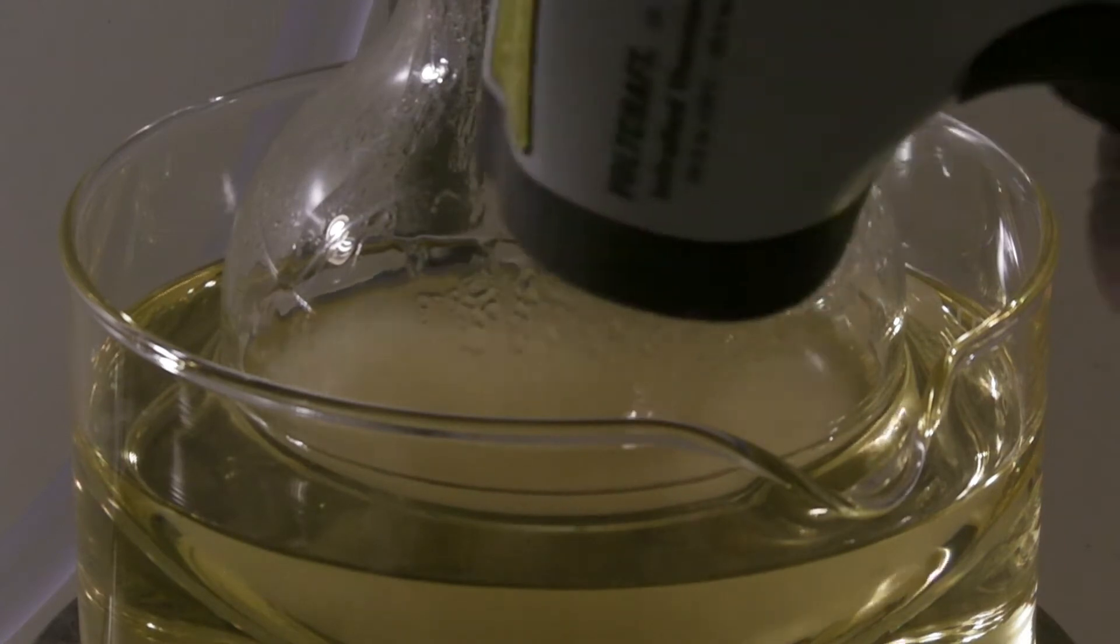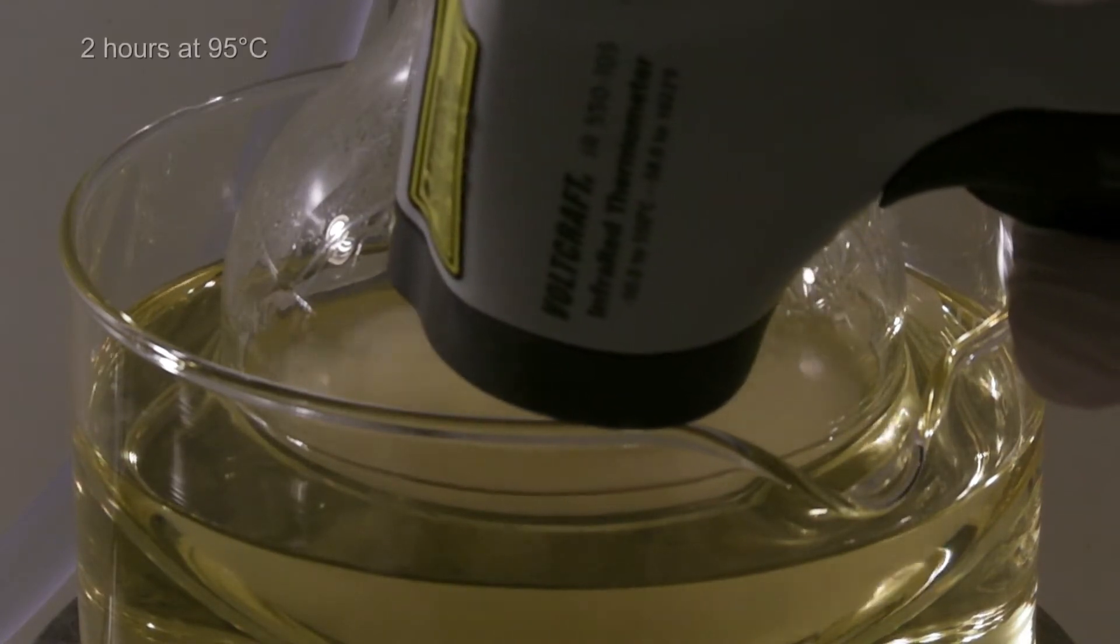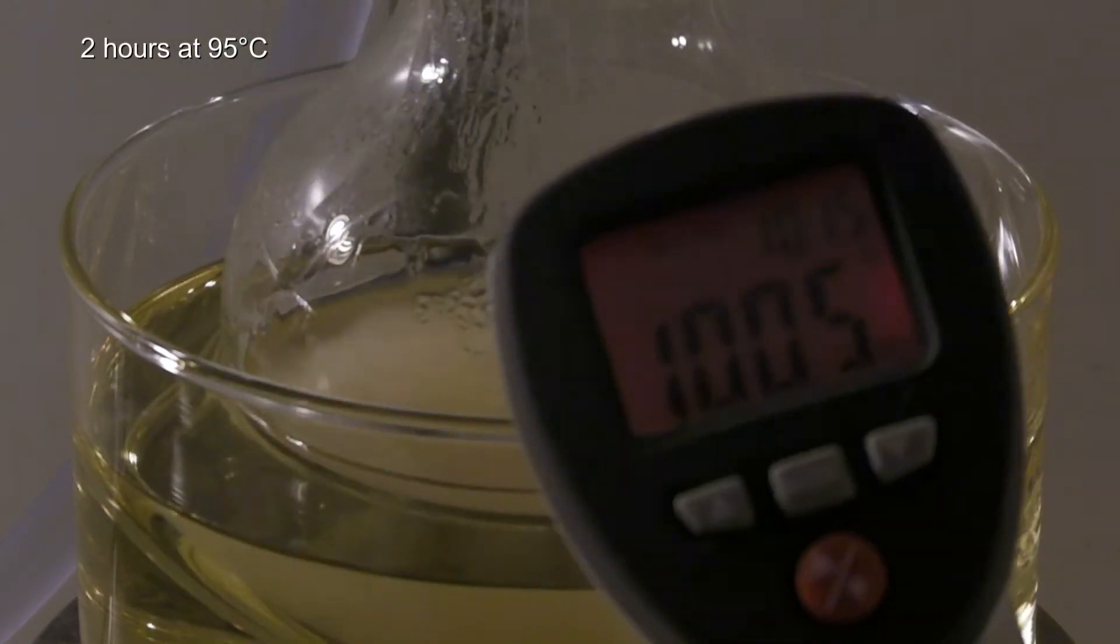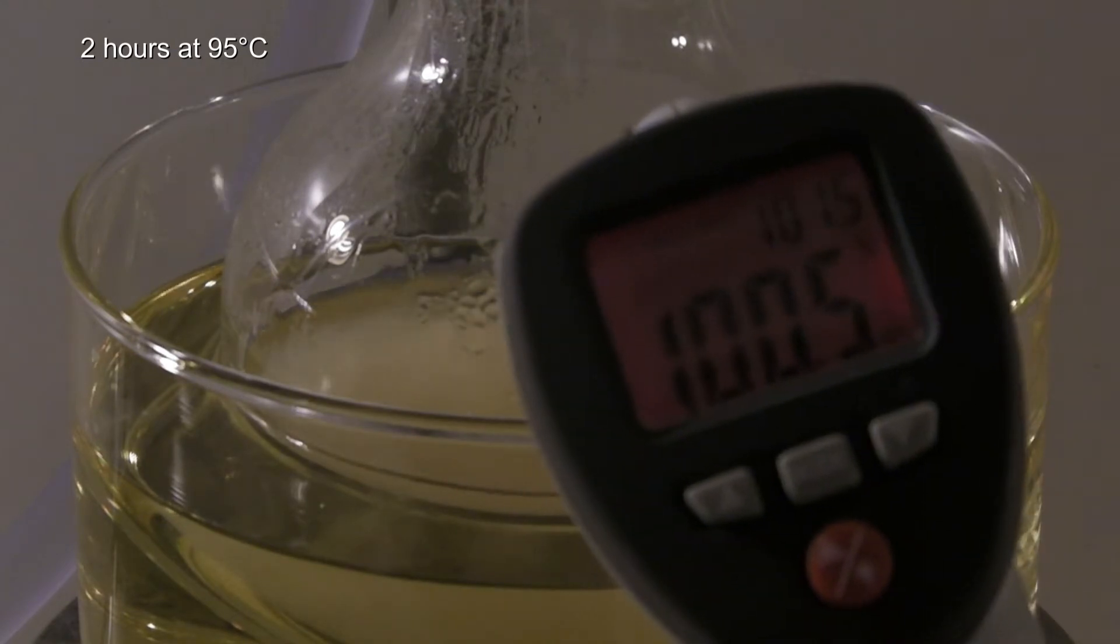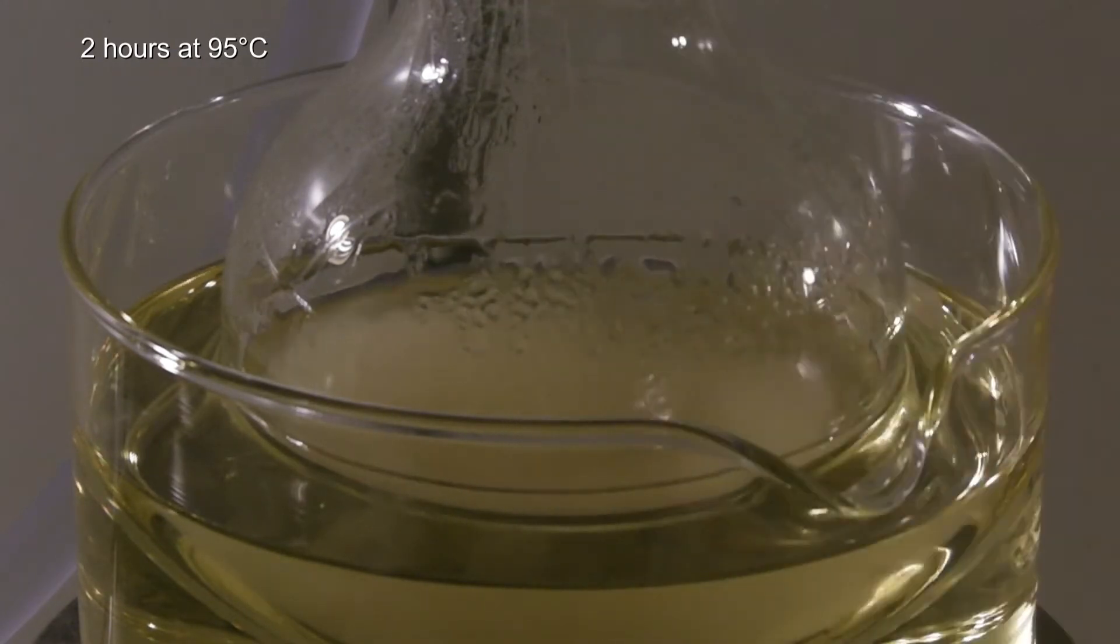The oil bath should be heated to 95 degrees C and the mixture had to be stirred for 2 hours. The stirring hot plate couldn't be set precisely to this temperature, so it was tried to keep it at least at 100 degrees C. By the end it did rise to 105 degrees C.